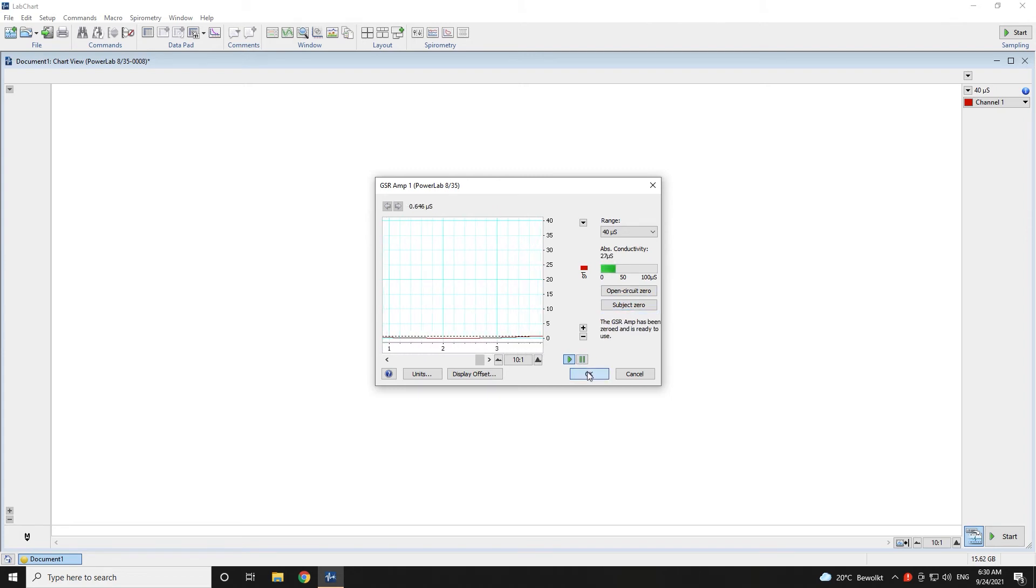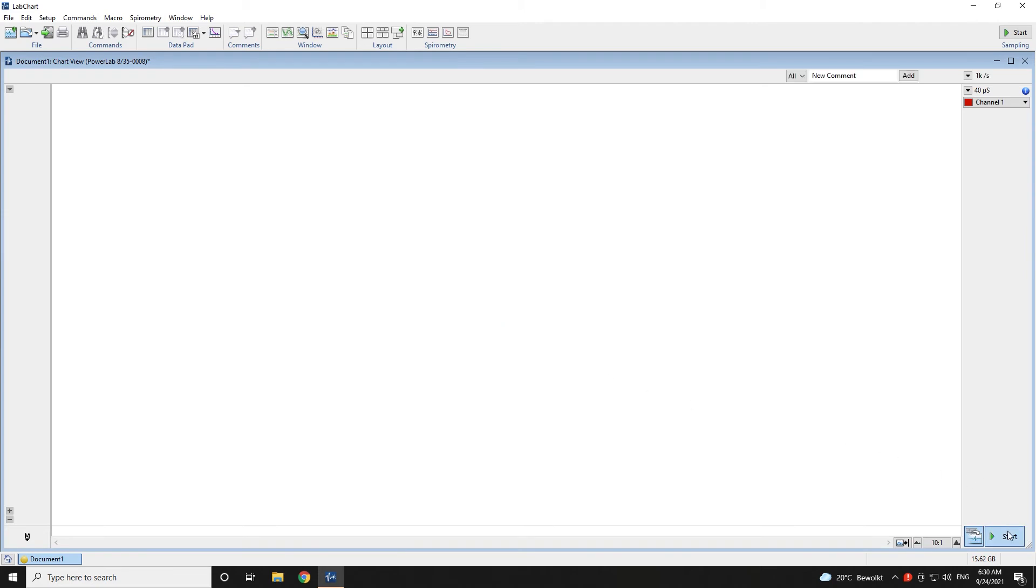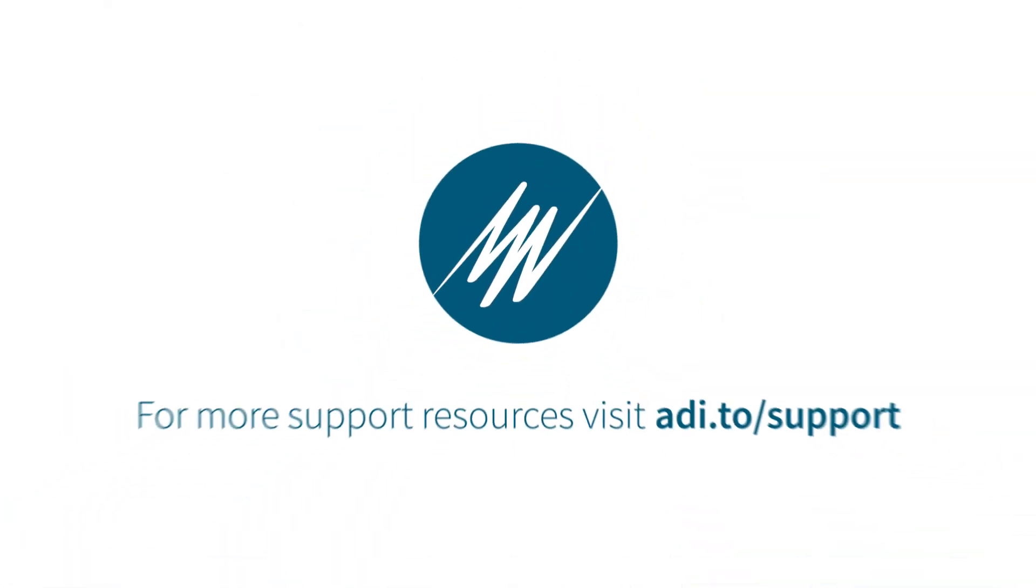Click OK, and in the main view of LabChart, click on start to start your recording.